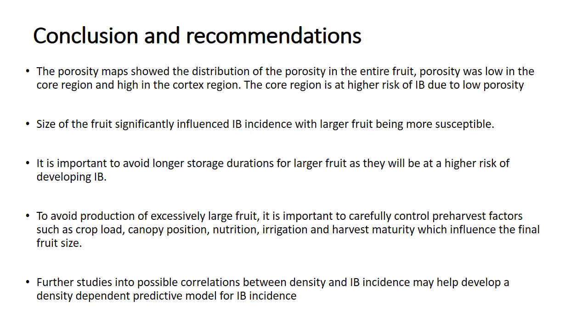Further studies into possible correlations between density and browning incidence may help develop a density-dependent predictive model for browning incidence.